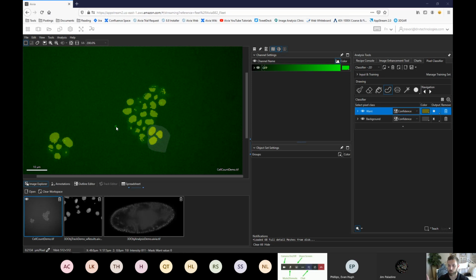But using this preview, you'll easily see that, after you train the first part where the intensity profile looks one way and you preview it, you'll see where the intensity profile looks another way, the segmentation looks very wrong. Just like here, we see some of these cells aren't very well characterized. You'll start filling in other parts of the image. So I'm going to use my brush tool and go paint elsewhere where I'm missing information and try to correct that.